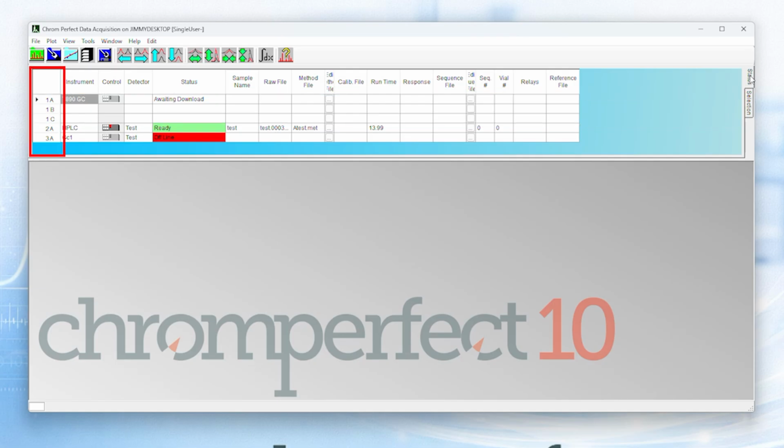On the Status tab, in the first column, you will see the instrument number followed by a letter, for example, 1A, 1B, 1C. Chromperfect supports up to 4 detectors per instrument. Each active detector appears as a separate line in the spreadsheet. Each active detector has its own real-time plot, its own raw file.